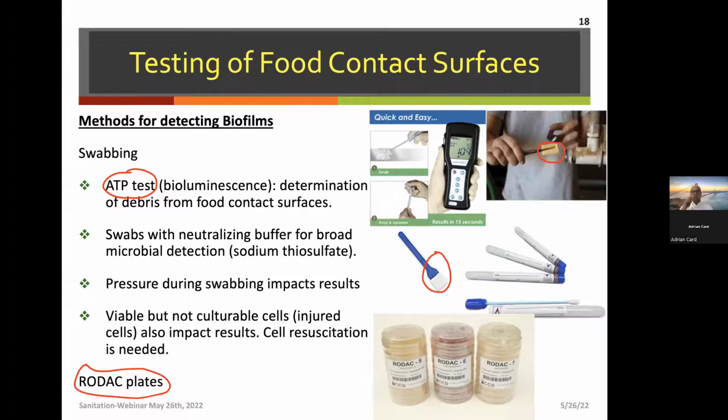The key aspect here is baby steps, and making sure that you are going step by step in the process. So what is the best practice? The best practice is first to start by listing all the equipment that you have. Once you have identified all the equipment, then identify that equipment by zone. Zone 1, Zone 2, Zone 3, Zone 4. And then once you've done that, start with ATP.